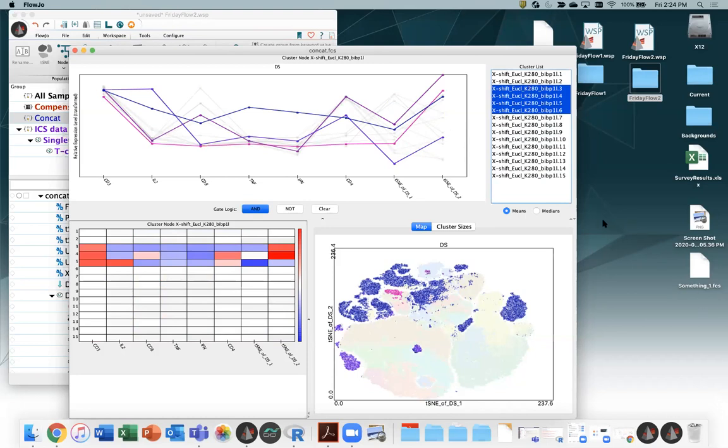Okay, with that, let me just check back at the chat and see if there's any more questions. So hopefully that was a fairly deep comparison of the main clustering and dimensionality reduction tools, what they're doing under the covers, how you might use them, how you might compare the results, and hopefully some indicator of which one might be best for a particular use case.